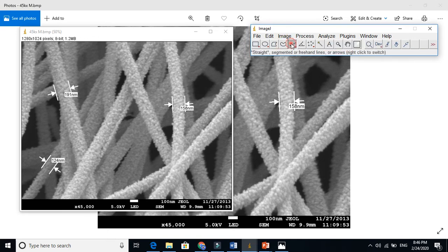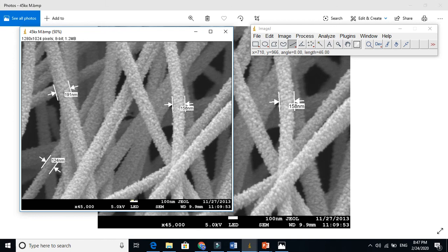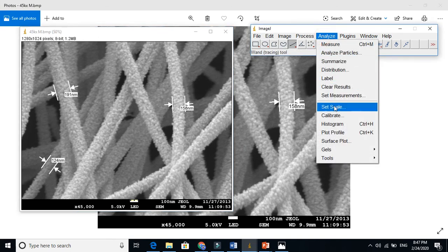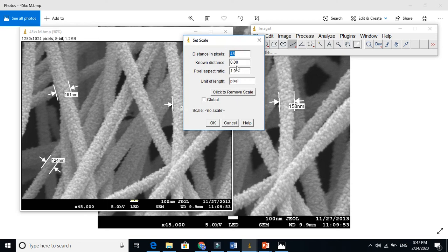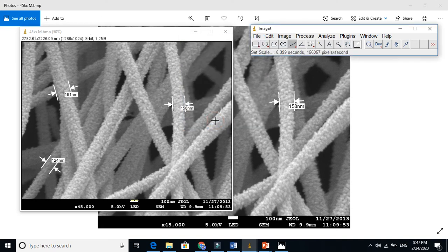Just tell ImageJ software, then how will ImageJ software read it? Press the shape button and measure the scale bar. When you do this, go to Analyze and Set Scale — this is very important. The scale is 100 nanometers; the unit is nanometer (nm).